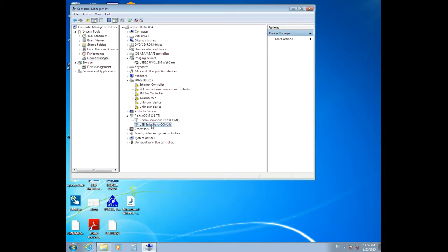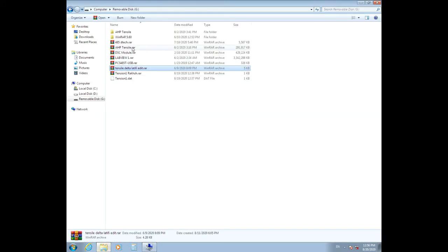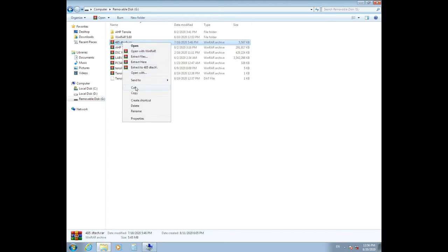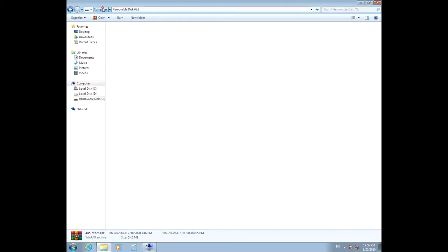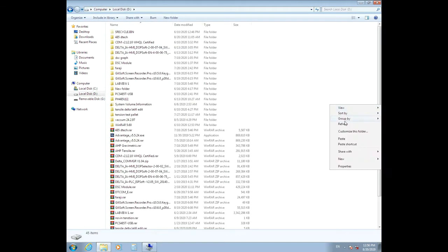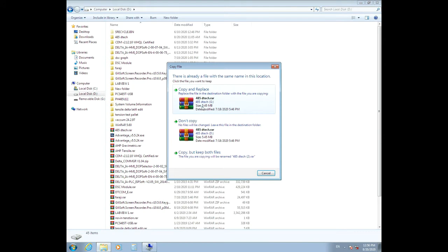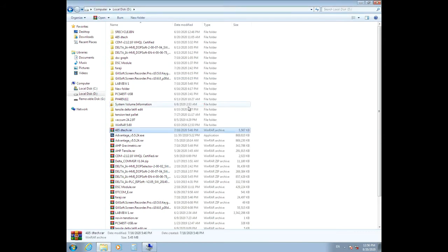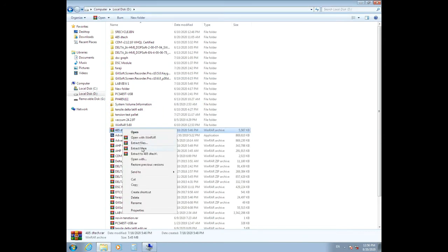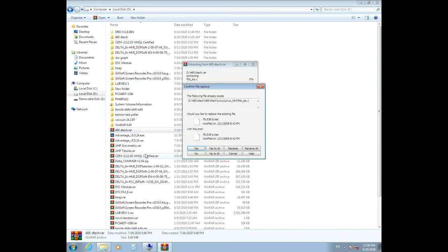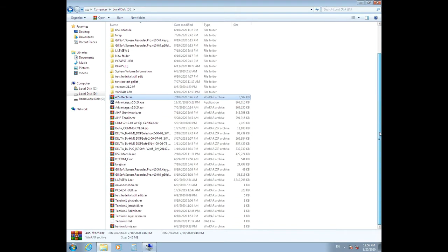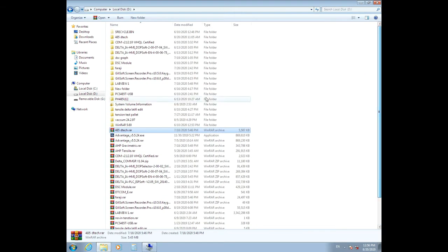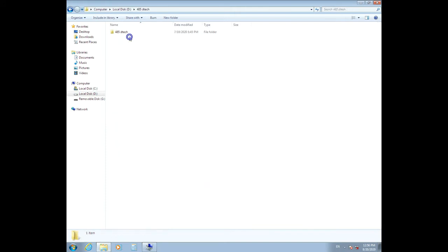For installing the driver, go to your USB flash, copy the driver folder to your drive, extract it, and open it. Here is the folder.